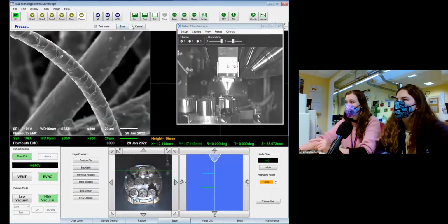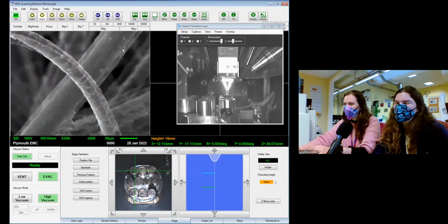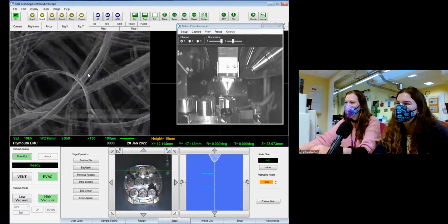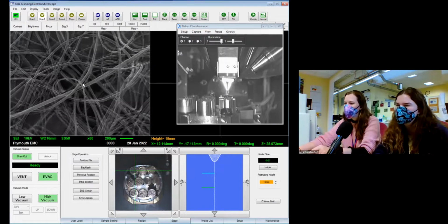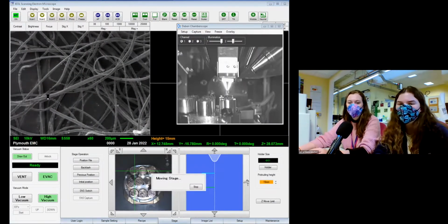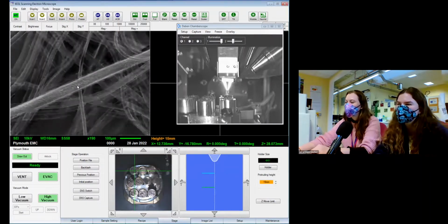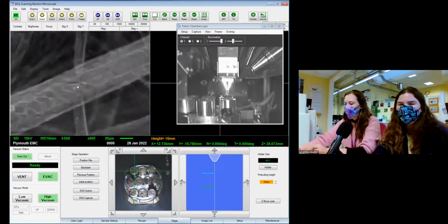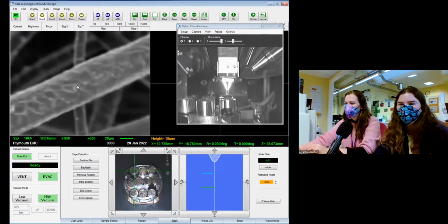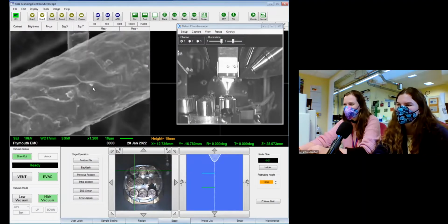Classic microscopist mistake, not saving the photo. We all do it. Don't save anything, you don't label anything, and then you go back to it a week later with no idea what anything means. I think that was the issue last time because you took all the photos and labeled them all, and I was like, I can't remember what was what. Especially when I was looking at the orange because we did the albedo and the flavedo. I'm like, which bit was which? Trying to reconstruct an orange, it's really hard.